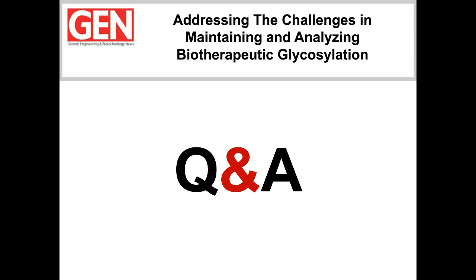And Ryan, the glycan data are very interesting. Have you tested the glycan tuning on more complex molecules? Were you able to increase glycosylation using this? Internally, most of my work was on a more simple molecule, mostly IgG molecules. But there's no reason why this shouldn't work for more complicated molecules, EPOs, things like that that have more than two glycosylation sites. It should work in a similar manner. It should galactosylate, and as you increase the number of galactosylation sites, you should also be able to open up more sites for sialylation if the particular cell line of interest is sialylating the protein.